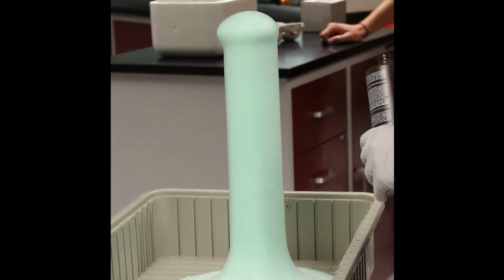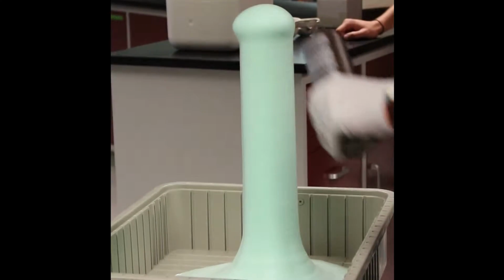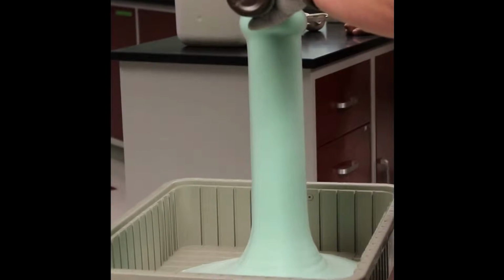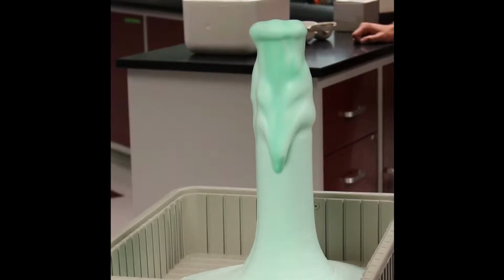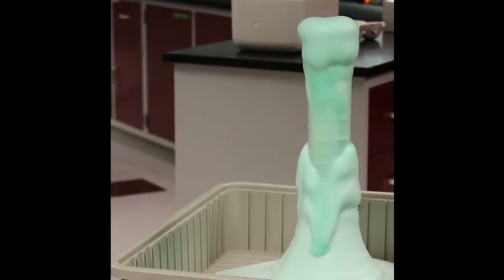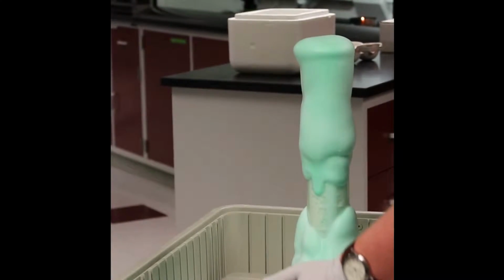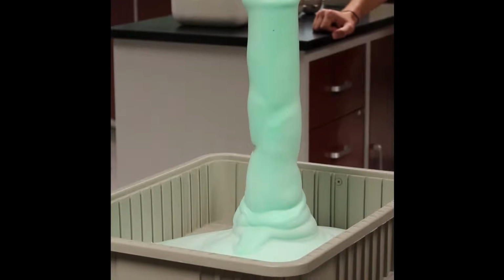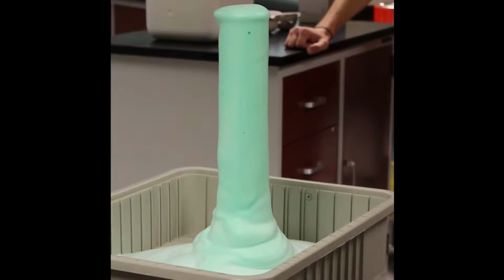And you get these bubbles because we've also added dish soap, and for the green color we've added some food coloring to our solutions. You can see it starts to foam up and foam over as the dish soap captures this oxygen. After a little bit, we take a smoldering splint and stick it into these bubbles. Not right away, because the bubbles are too small. There's not enough oxygen for all the water that's in those bubbles. But after a little while, some of the bubbles start to combine. We're able to stick a burning splint in there, and you can see it flame up nicely, which is a pretty neat thing to see.